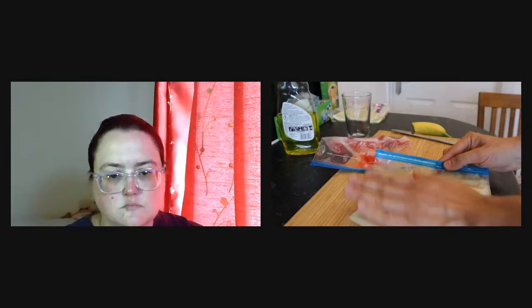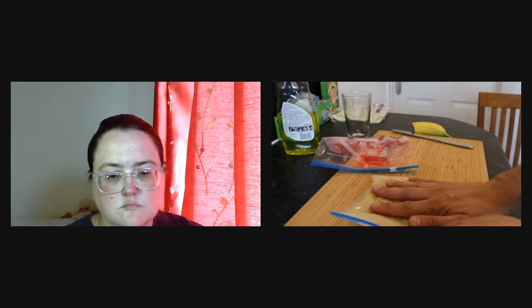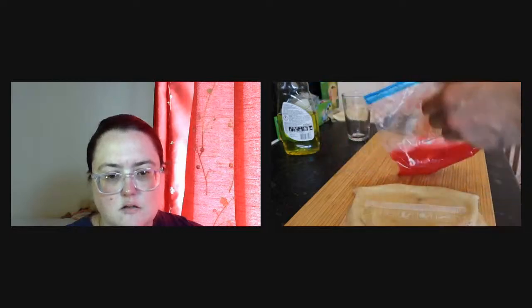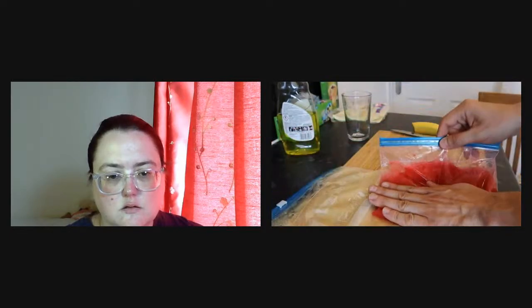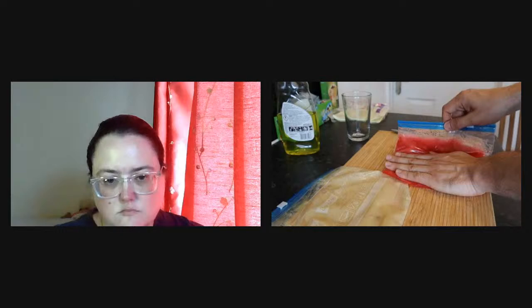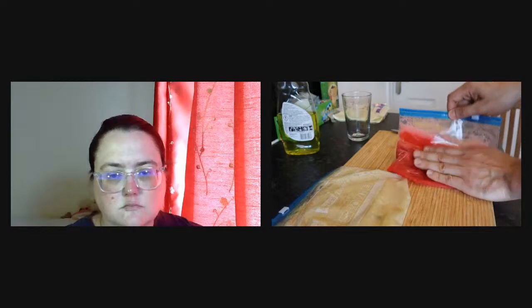When you have a transparent mixture, you kind of know that you get good lysis of the cells, so that you know that your DNA will be well extracted afterwards. It is important to take your time to make sure that all the cells are as much broken as we can, that we have mixed very well, so that we get the best results.